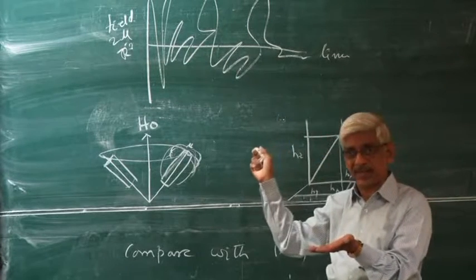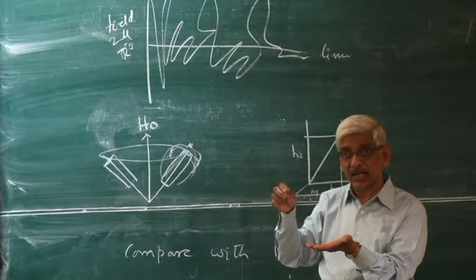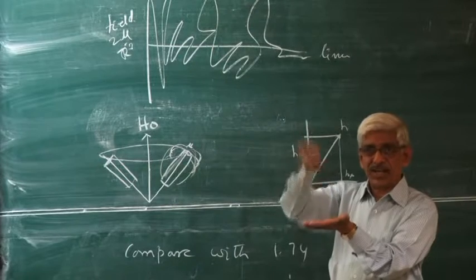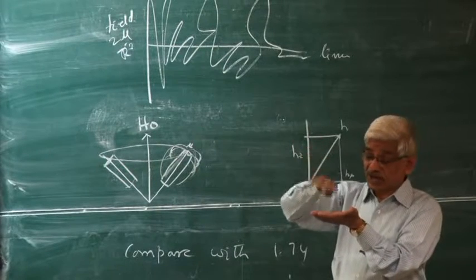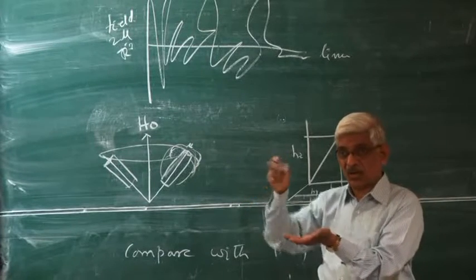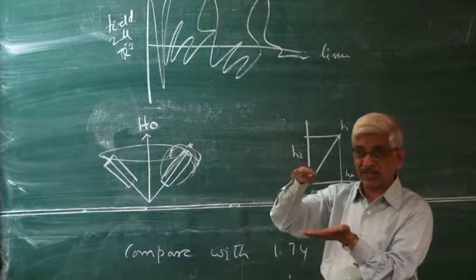That field is also present here. That gives the degeneracy lifting, yes. So you have the two energy levels there. And the population difference is created by these transitions. Okay, but degeneracy is lifted. Degeneracy is lifted by B0.